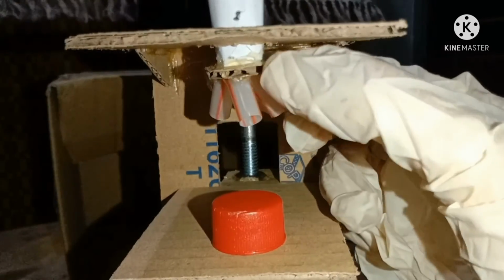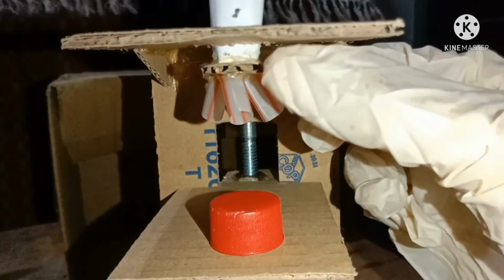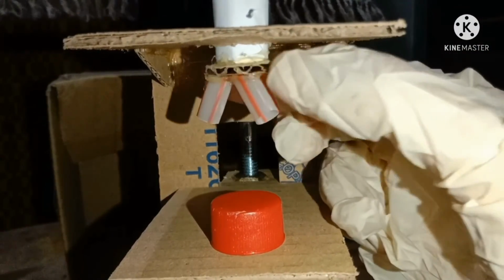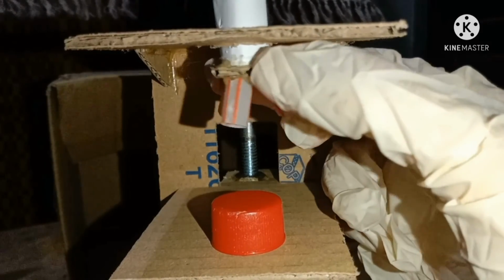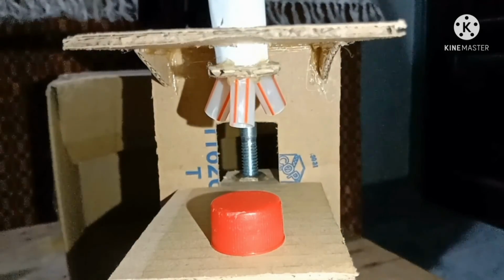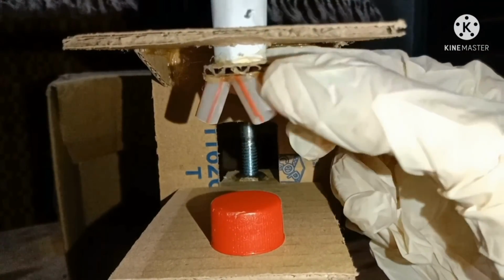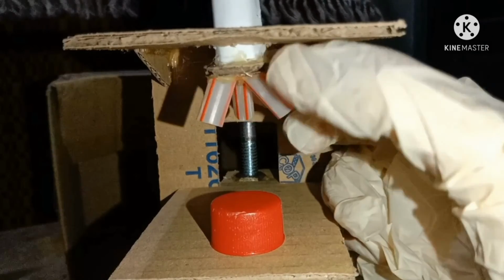For the next step, you can adjust the magnification lens to zoom in on the sample surface by rotating the magnification lens. Be reminded, do not hold the magnification lens body while adjusting. Use the magnification lens holder to change the magnification lens.